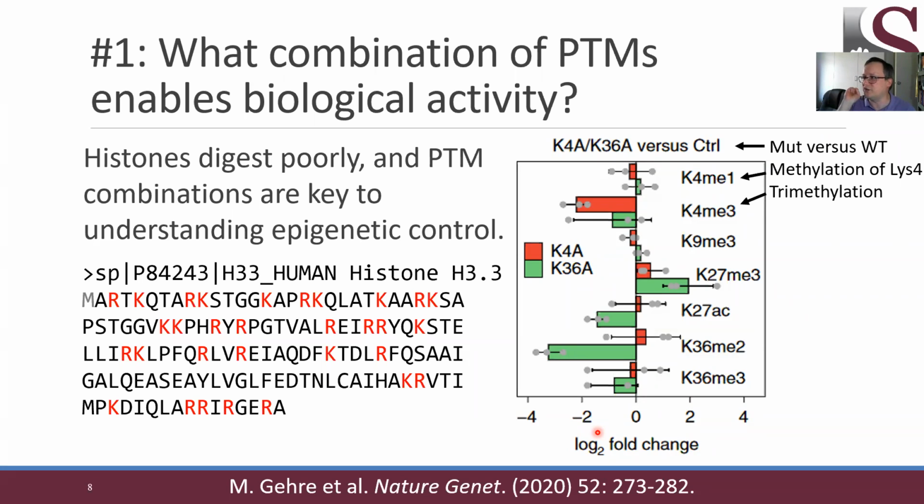That a phosphorylation at site serine 50 versus one at threonine 48 may have interacting capabilities, that both of them need to be phosphorylated, or it's just as though neither of them is phosphorylated. So if you're trying to do this kind of analysis by shotgun proteomics, you're going to be limited to the fact that individual peptides may come from different proteoforms.